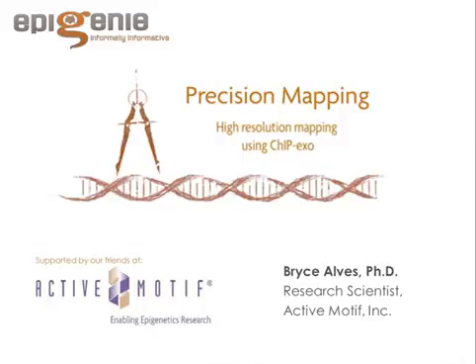So final question here, and then I'll go ahead and wrap it up. What's the most critical step in your view? Would it be adapter ligation? Definitely adapter ligation. Without the proper adapters, the whole reaction downstream is stopped.